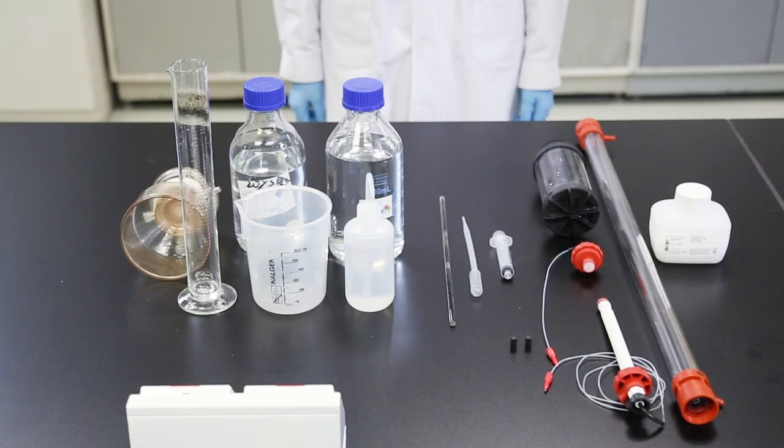In this video, we will show you how to pack an XK 16 over 70 column with a size exclusion chromatography resin, Superdex 75 prep grade. The dimension of the column is 16 mm inner diameter and 70 cm height. We will pack the column with approximately 120 milliliters of resin.